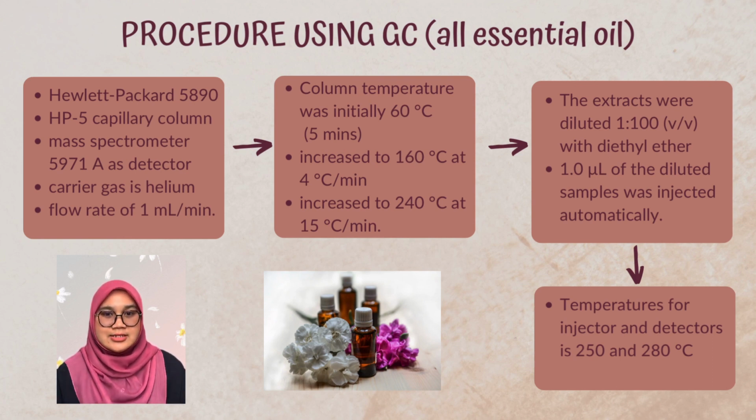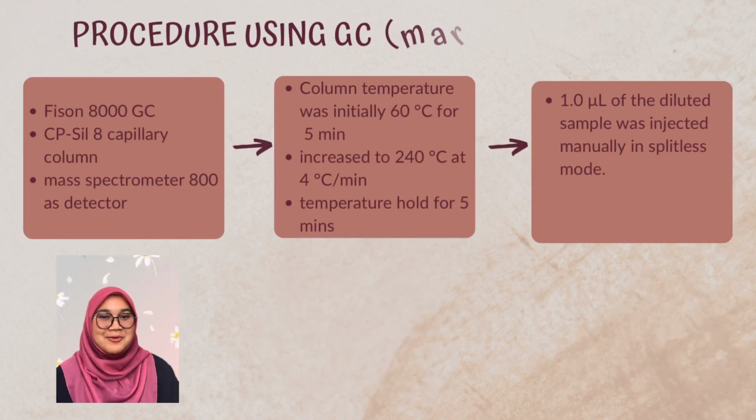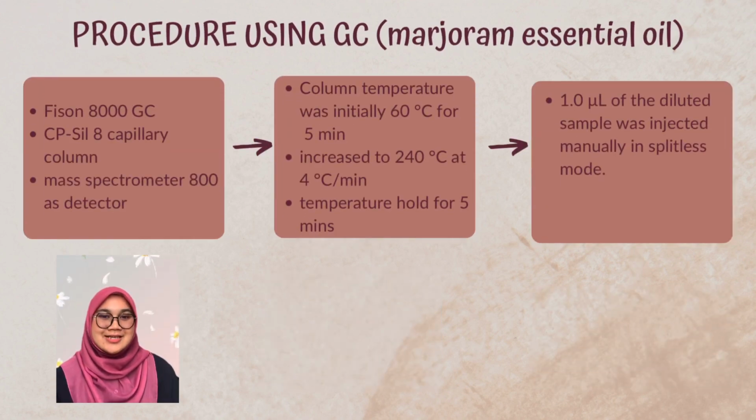Injector and detector temperature was set at 250 and 280 degrees Celsius respectively. Now, I will continue with the procedure using gas chromatography machine for analysis of marjoram essential oil.